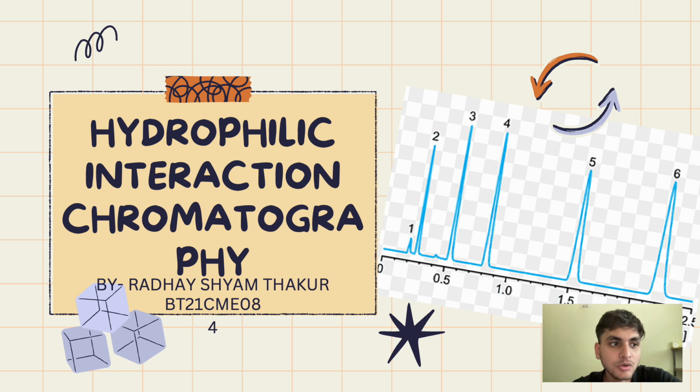And as we all have dived into the concepts of chromatography, we all know that chromatography is a laboratory technique used to separate, identify, and quantify the components of a mixture. It involves passing a sample through a stationary phase which separates the components based on their interaction with the phases.